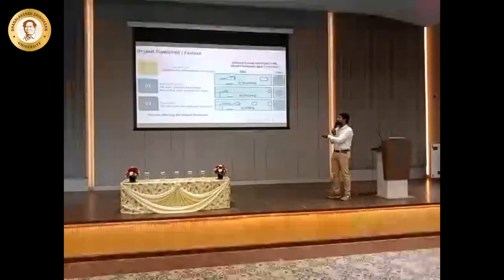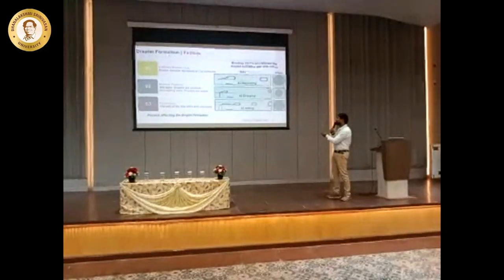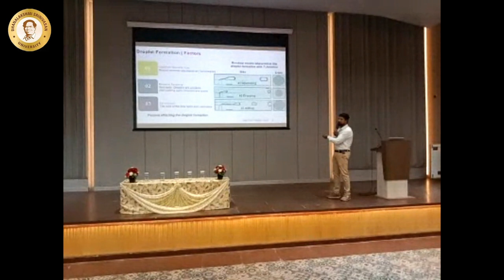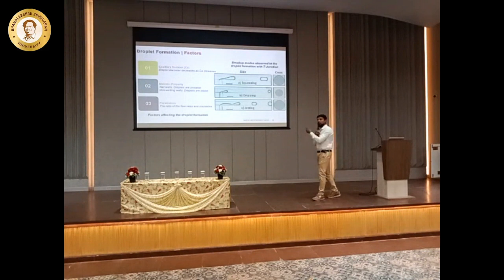If I start increasing the flow rate of my oil, the squeezing will not take as long. Here you could see a large amount of squeezing, but here it will be very short and it starts breaking down much faster, and you make a smaller droplet. Here I'm just trying to control the flow rate. I'm increasing the aqueous flow rate. What happens is, again, a jetting process takes place. Either of these can happen when aqueous and oil interact. This all basically depends on the capillary number.